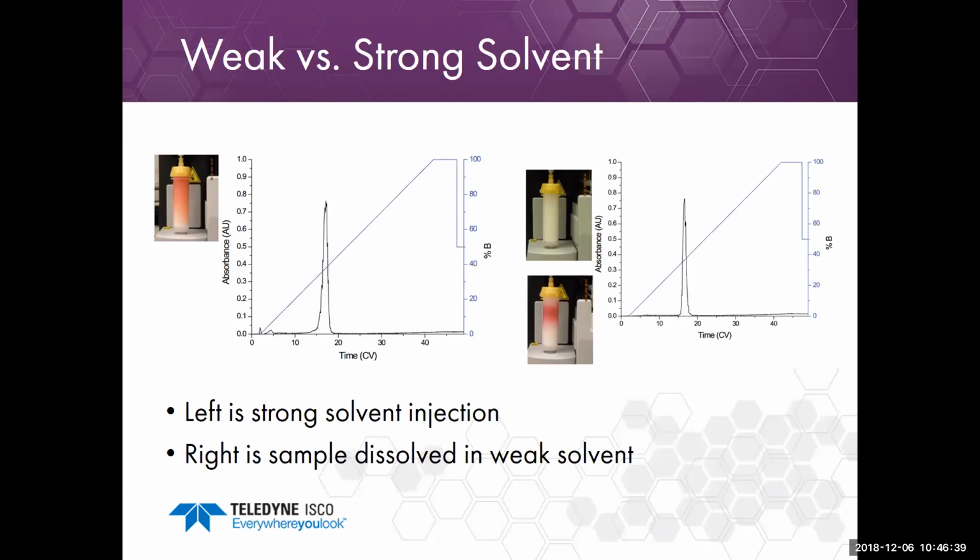Okay, and the question comes up with actually silica. The thing with silica is you can sort of reuse them. The problem is that you also absorb the mobile phase on it, and so you've changed the chemistry.